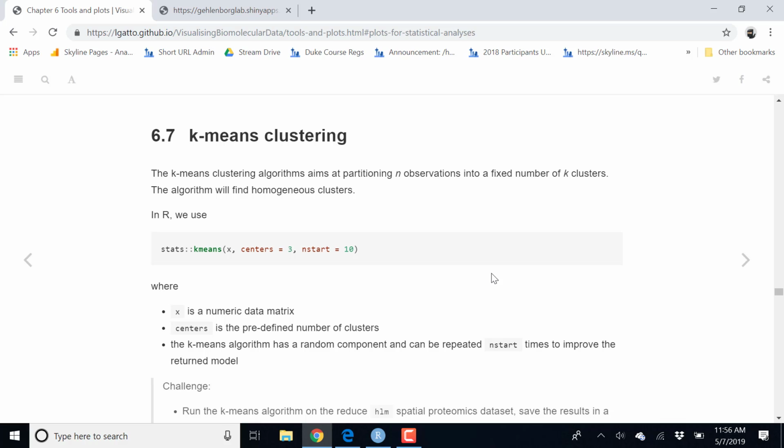And that's arguably the most difficult question in clustering. So we have k-means clustering, hierarchical clustering, you can use different distance methods. And there is no easy way to answer what clustering methods we should use, what parameters we should use. But all these are relatively easy compared to the real difficult question, which is how many clusters to find.